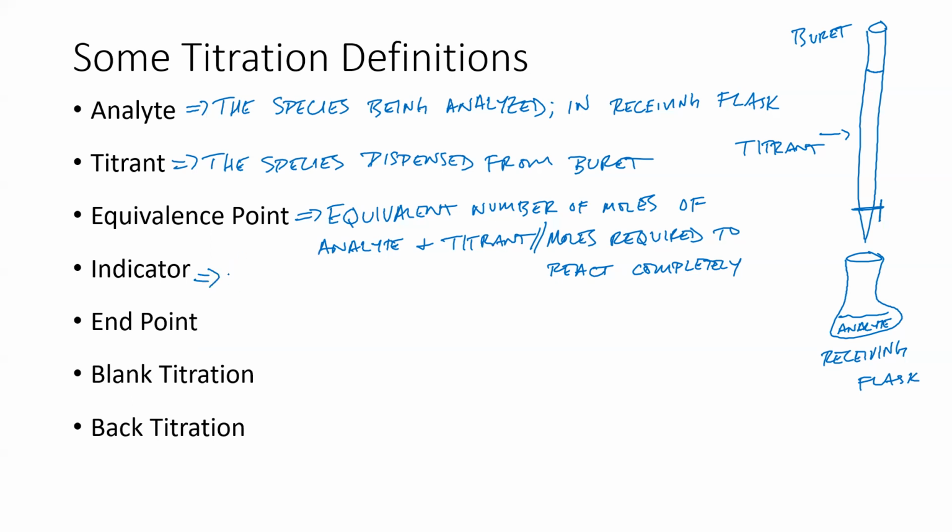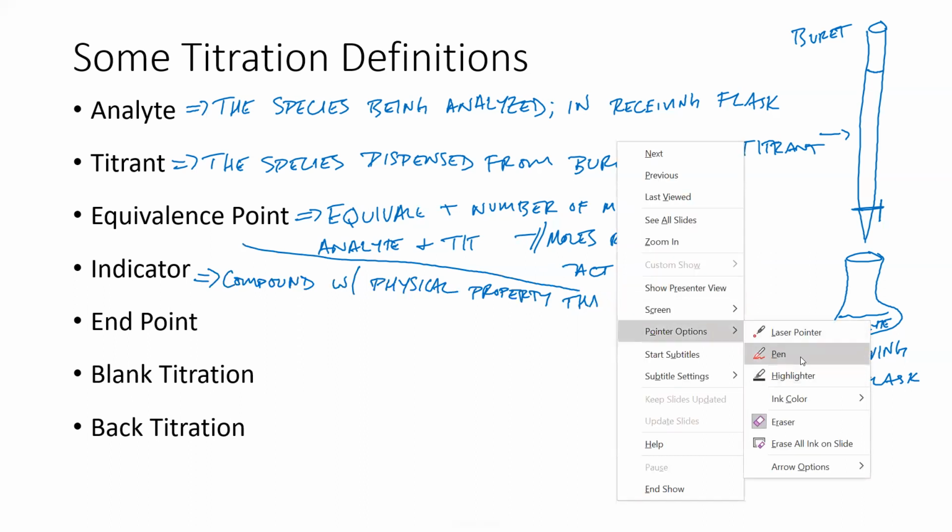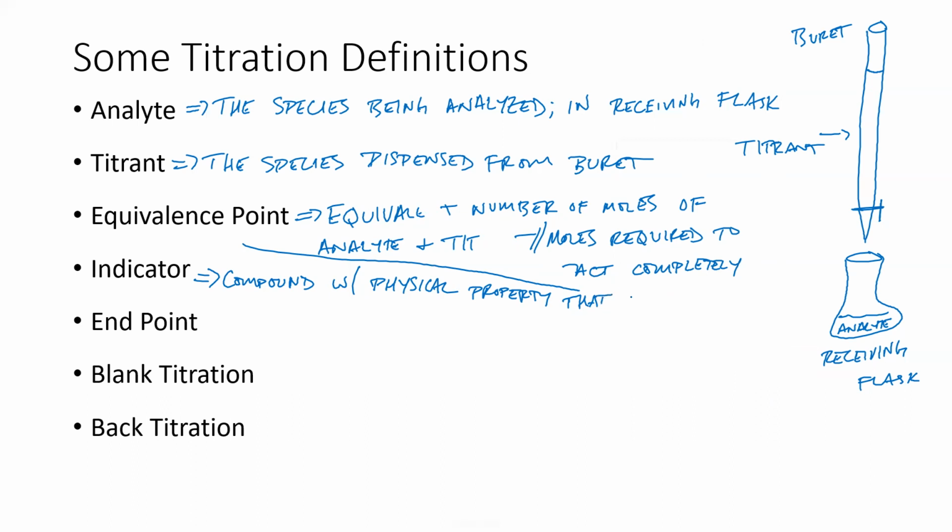The indicator is a compound with a physical property, sorry for my slant here, that changes when the reaction is at or near completion.